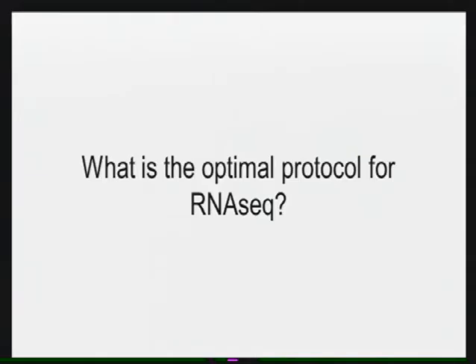You can check for contaminants, and some of it's a little bit specific to your protocol and what you want to get out of it. And I could also afterwards send you the list of what I typically do for QC if you're interested in that. So, all right, we'll come back to that in just a minute.